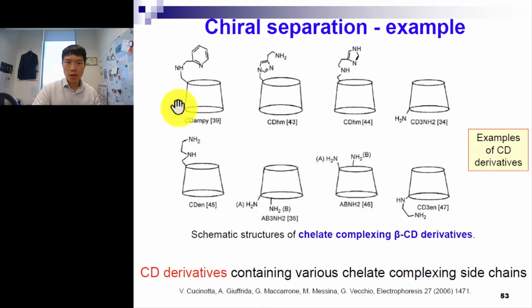So you see here you have 8 different cyclodextrin derivatives. It's more of organic chemistry, how you change this extra arm in terms of changing affinity, having a bit more polar groups, or introducing this aromatic ring that will affect the binding affinity, and that causes the shift between the complexed and the free form of your analyte.